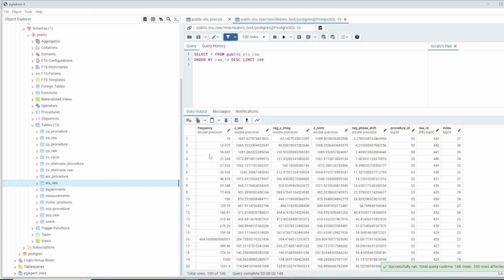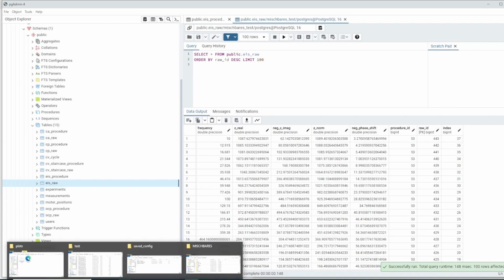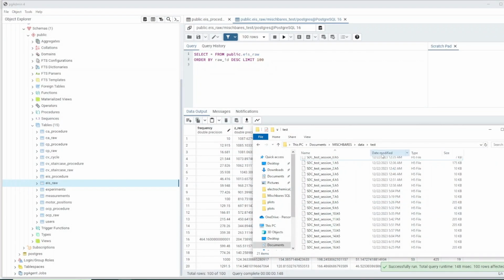Simultaneously, all the raw data is stored here as well. Each procedure and raw data ID are unique, so it would be easy to retrieve them at any time. This was our database server. Finally, I also wanted to show you that our initial HELAO server keeps track of all the metadata and every step along with their time steps, which are saved here.